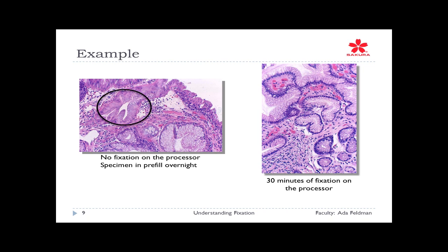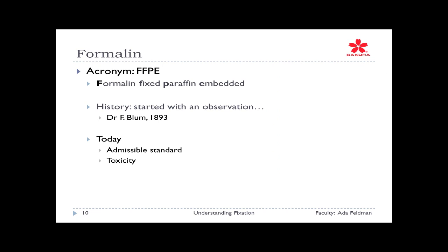Okay, let's start talking about the chemical reactions and take a look at our famous fixative that's pretty much used 90% of the time, okay, and that is good old sweet formalin, okay? It's used so much it's given its own acronym, all right, formalin fixed, paraffin embedded, all right? It gets its history, and if you understand why we're using it, you may understand why it may not be the most optimal in terms of where it got its start from, okay?